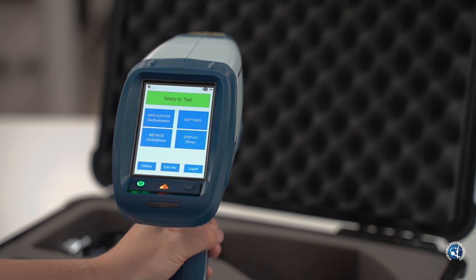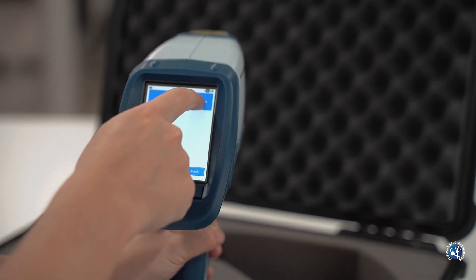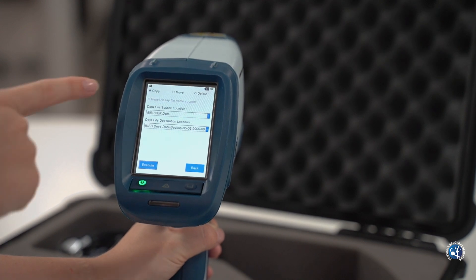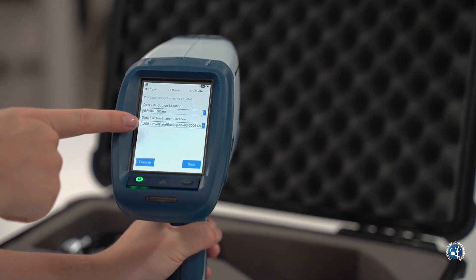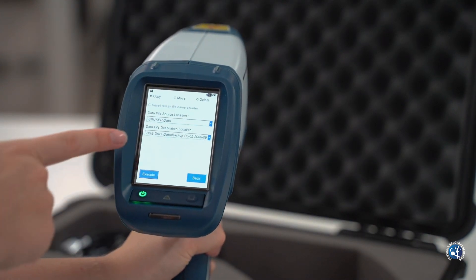To export the results, ensure a USB is in the USB port. From the home screen, press utilities, backup data. Check the destination is located to the USB and click copy. Then press execute. This will transfer the data.